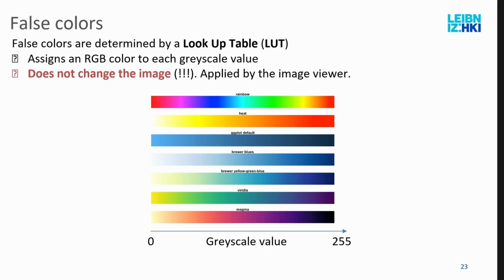And you don't see it anyway, because our computer screens only have 8-bit RGB, so you just waste a lot of compute and space. So this is generally how all lookup tables work in all tools. It really looks like that, and you can even make custom ones in some tools.